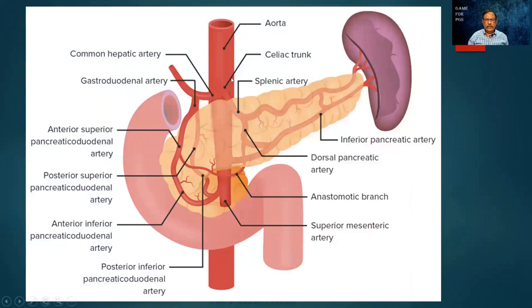Look at this over here. So there is a superior part, there is a descending part, there is a transverse part which gets ascended, and then finally it ends as a jejunum. A beauty of it is there is no abrupt conversion from the duodenum to the jejunum or to the ileum. In fact, sometimes when a slide is given to us, we have some amount of difficulty in localizing it as the ileum or the duodenum or the jejunum. Duodenum, of course, we'll have to look for the Brunner's glands.